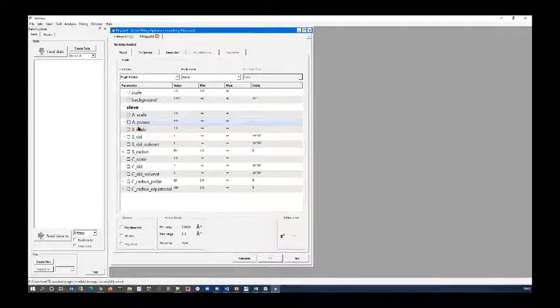Okay, so again, the power law parameters are prefixed with A, the sphere parameters are prefixed with B, and now the ellipsoid parameters are prefixed with C. How do I know those are the ellipsoid parameters? Because rather than having a radius and a cylinder length, I now have the polar and equatorial radii. So I know that it has actually changed that.